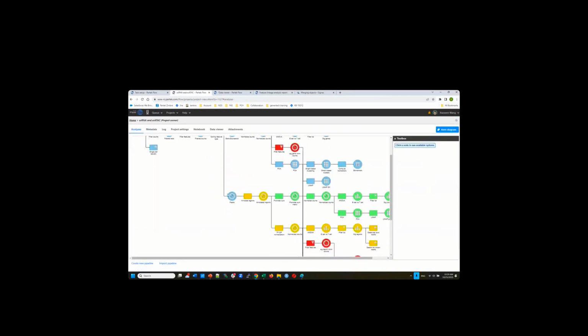Now let's take a look at the peaks. For the peaks, we only have the location: a chromosome, start and stop. You definitely want to know how this location relates to a gene. Is it in the gene's exonic region, intronic region, or intergenic region, right? Or promoter region. We want to annotate the peaks. So that's the first step I would like to do.